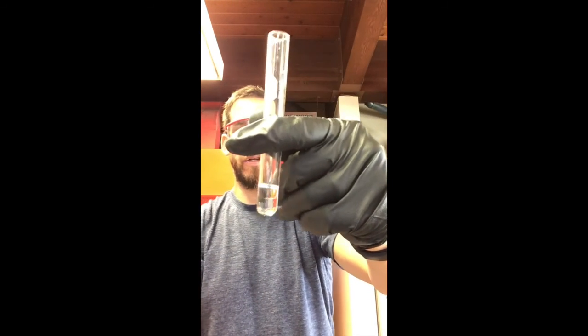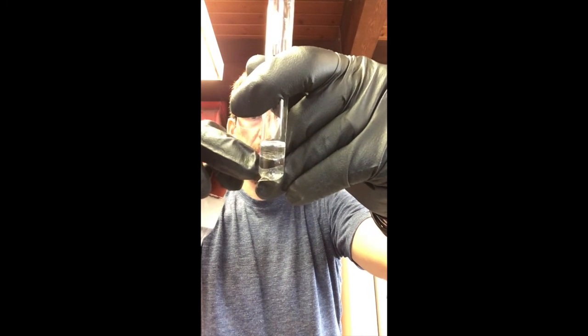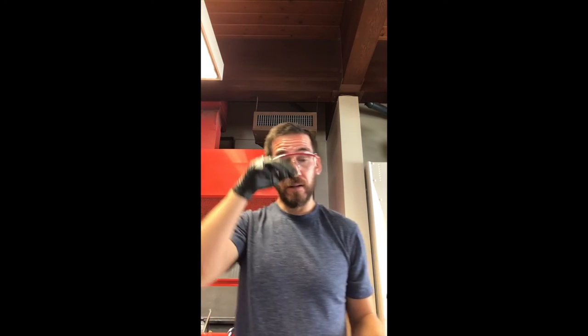Okay, let's see if we put more in, see what happens to that bubble. It's just growing, right? So you can see there's clearly 2 layers. There's this top one. That's what grew, okay? So number 3 is probably organic, and it's less dense than water.